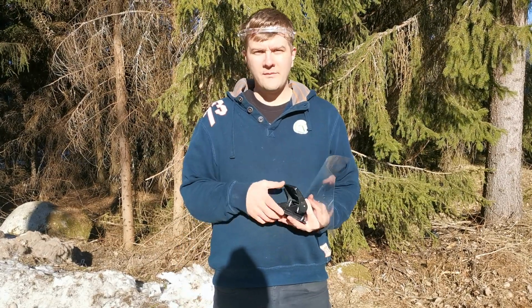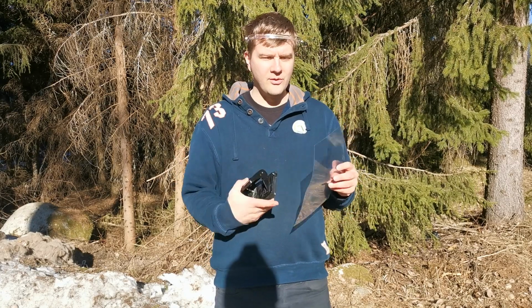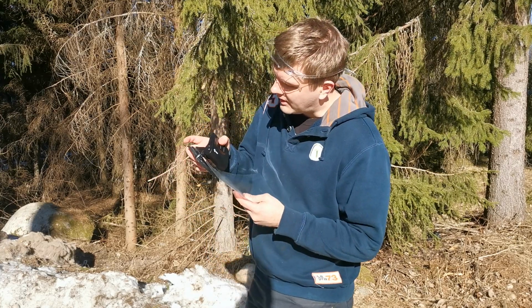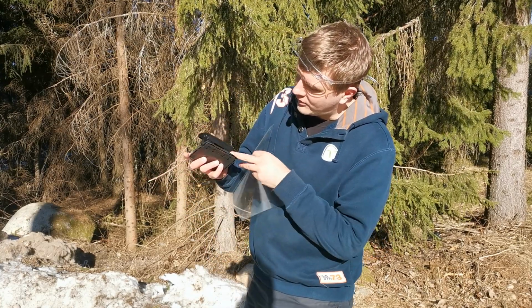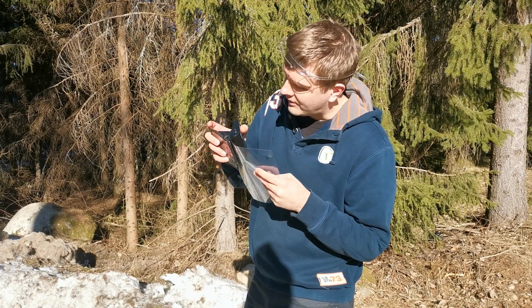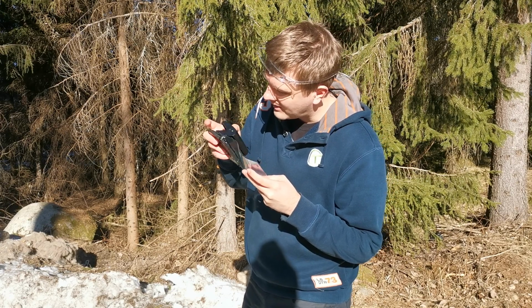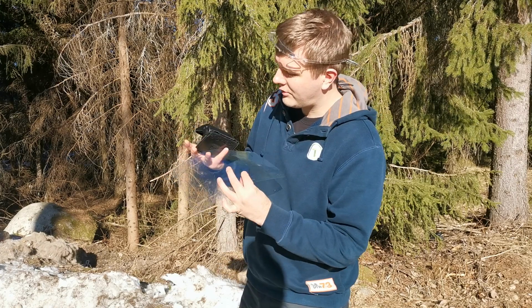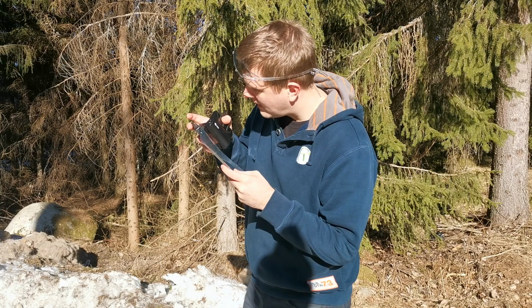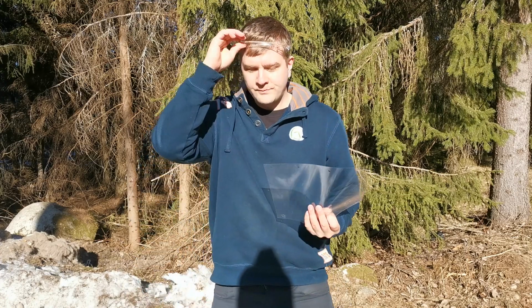Hi everybody, I have designed this kind of head protection gear holders, and it's meant to be used with PVC A4 clear plastic sheets. I'm using a 2-hole punch which has an 80mm difference in the holes, and you just put it in my punch to the minimum setting and press. You get 2 holes, then you turn it around and there's your gear ready to be installed.